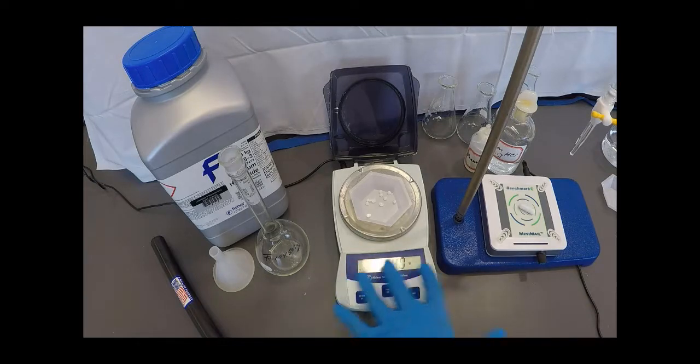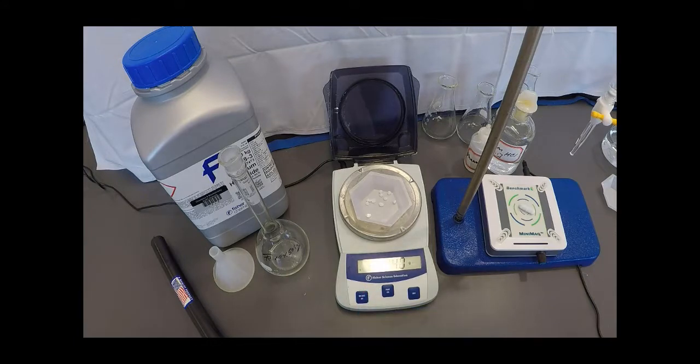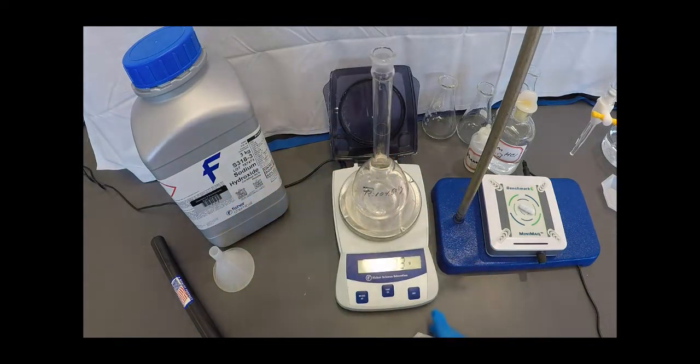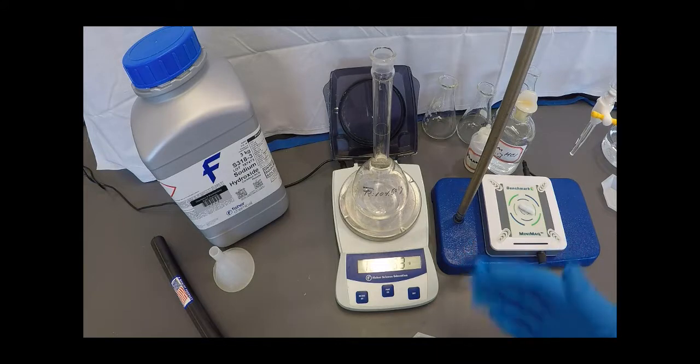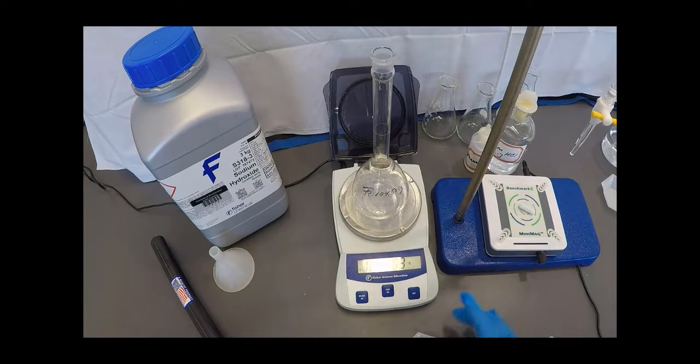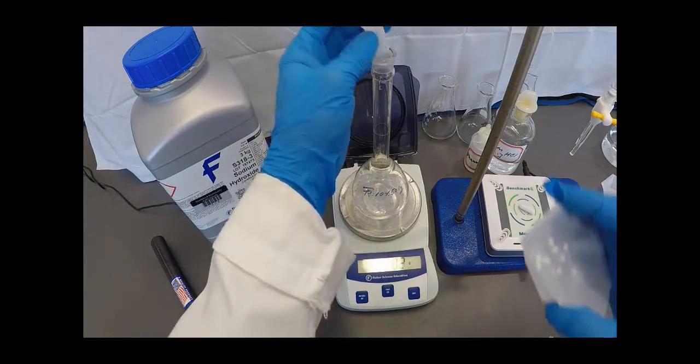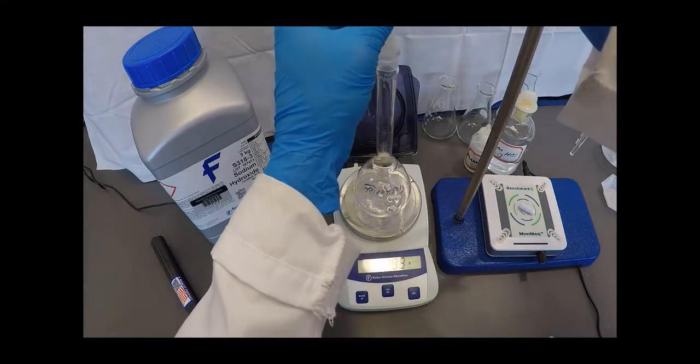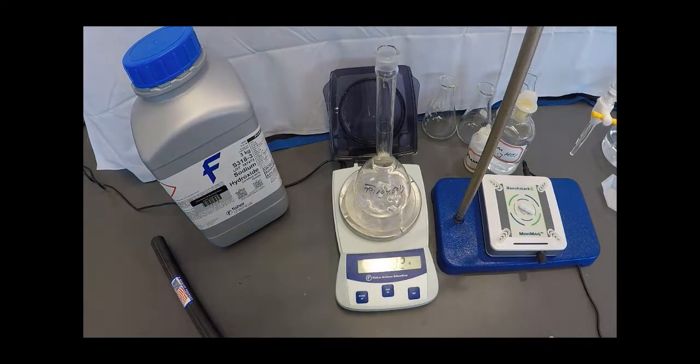So now that I've got approximately one gram, 1.040 grams of sodium hydroxide, I'm going to take a clean 250 milliliter volumetric flask. And so to make up a 0.1 molar solution, I would need one gram of sodium hydroxide. So I'm going to tare this. And as you can see, I've got 1.031 and that number should drift upwards as that sodium hydroxide takes in moisture from the air.